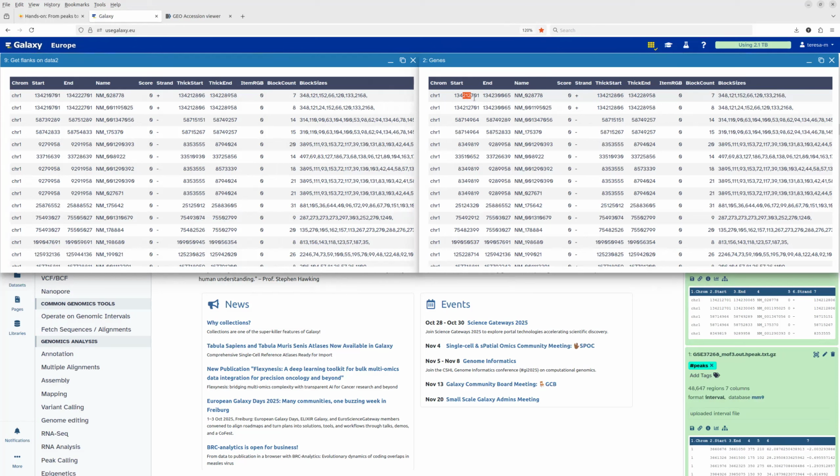And now we want to add the promoter region. So we need to go upstream. It's on the plus strand, which is also important. So upstream, we reduce 2000 because this is the region that we added in hopefully detecting the promoter region from this. So it's very simple. This number should change into a 0, right? And voila, we have exactly at this position now a 0. So we have upstream added 2000.